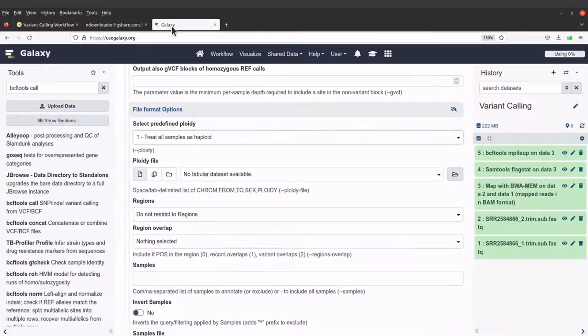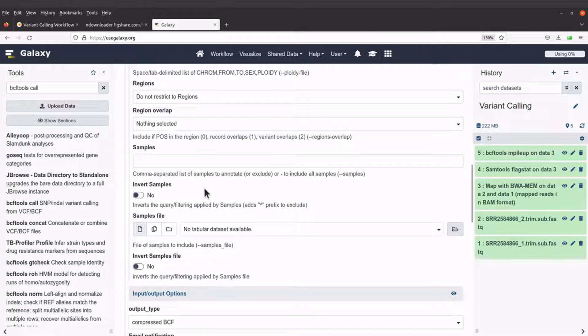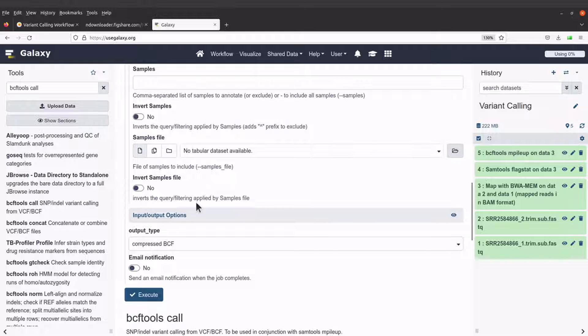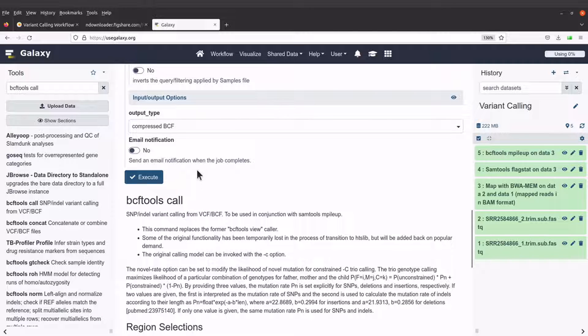So we will use the same thing here. That is what we have. Let's scroll down. I think so far everything is okay.